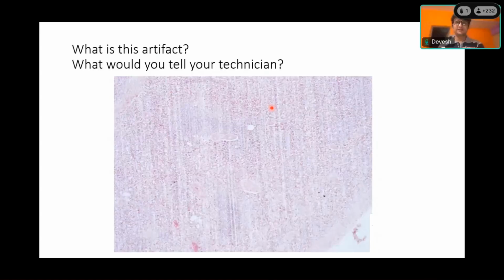I don't know. Yeah. So one easy way by which we do is put it under the microscope. Under your scanner view, you get the edge of the blade into focus, and it should be an extremely sharp, thin line. So any nicks in the knife will be magnified and you can easily make out. Yeah. So that is how you make sure. And if even your disposable blades are like that, many of them are like that, then you should call your vendor and ask them to change.